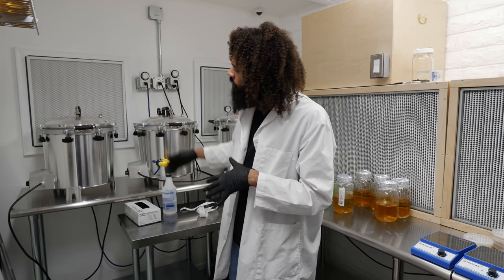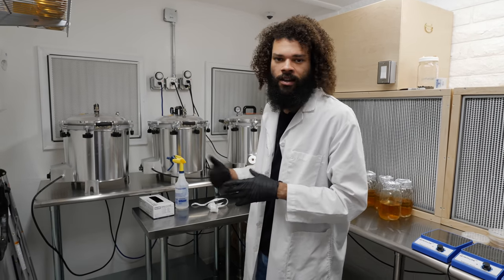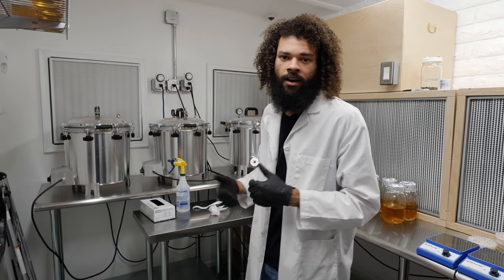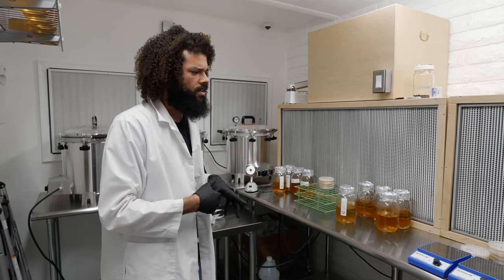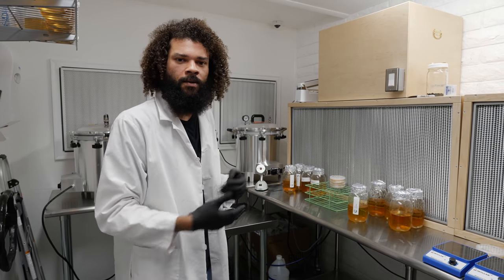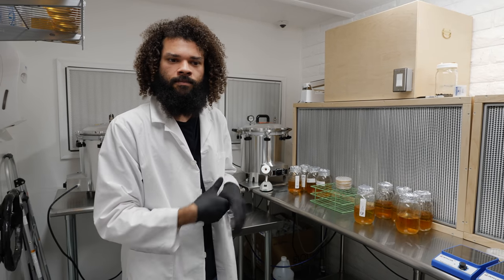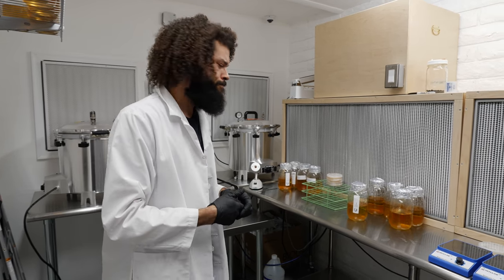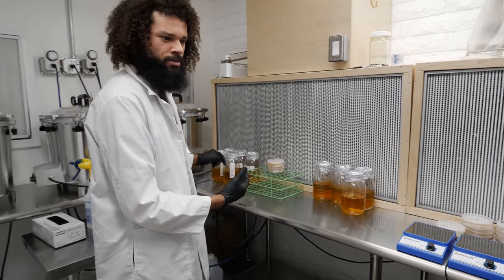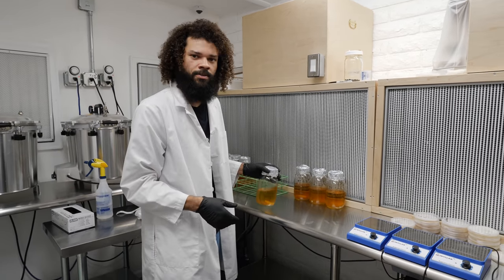We also have a few smaller autoclaves — they're all American-made and they do great for sterilizing small amounts of cultures, liquid media, or agar. This lab really helps take a lot of stress off my plate because I can come in here while another lab is running and just start working on cultures. Both labs are very good labs that take care of the jobs they need to do.